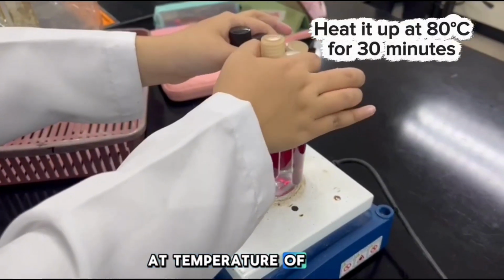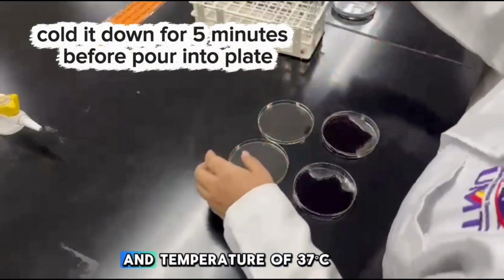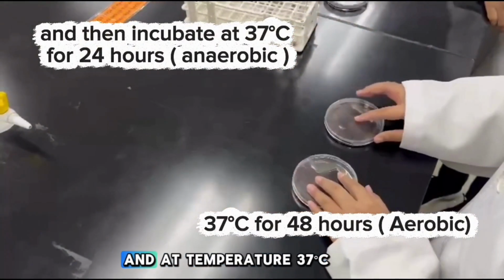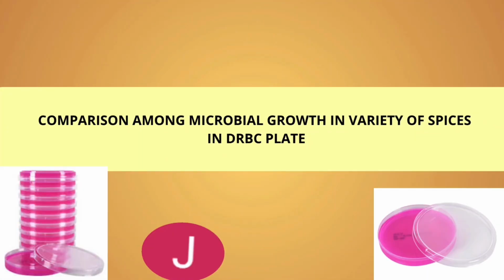Heating it at a temperature of 80 Celsius for 30 minutes. After 30 minutes, cool it down before pouring into plate. For aerobic, incubate at a temperature of 37 Celsius for 48 hours, and for anaerobic, incubate at a temperature of 37 Celsius for 24 hours. First, I will compare the results among microbial groups in a variety of spices in this plate.